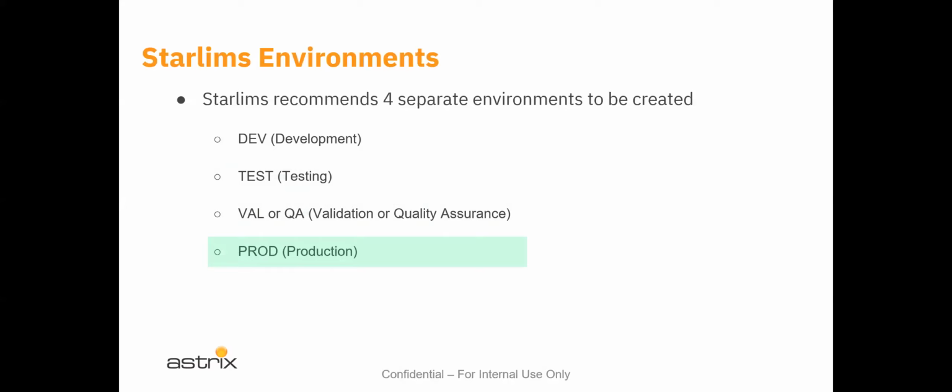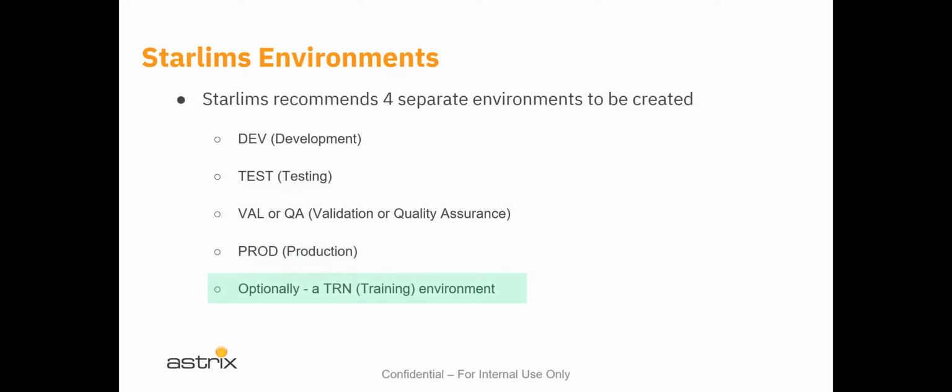So these will be 4 servers, whether virtual or cloud-based or even hardware-based servers within a client. Typically, I've not seen in a while now 4 hardware servers. It's all cloud-based or virtual. And optionally, a training environment. That one I don't see too often.